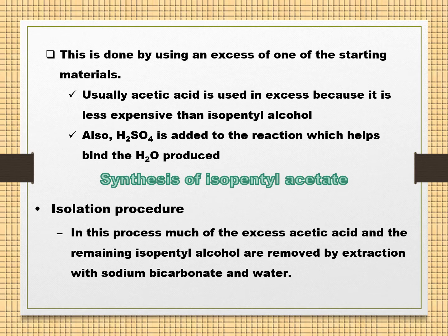In fact, we're also adding sulfuric acid in the reaction as a catalyst, because it helps to facilitate the reaction. What specifically the sulfuric acid does, we have a separate slide for that, and we will be discussing it at that slide.